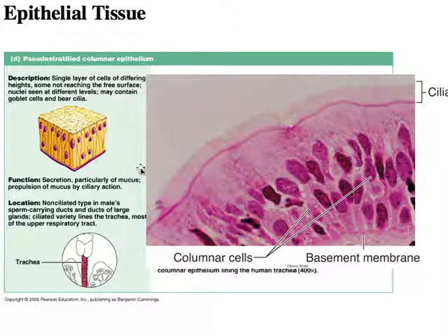So here we have our space. So this is the apical surface here. And then down here we have the basal surface because it's connected with the connective tissue down here. And then you have all these crazy looking nuclei that look like they're just packed all around each other and fighting to get to the top. And look at the sketch. It's quite representative of what's going on over here. I know it looks a little bit different, but you can start to kind of see things.